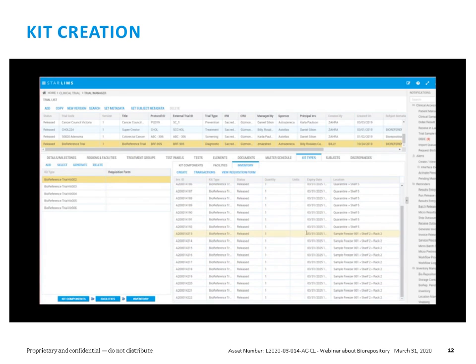The transactions that we have in our system then will be basically all tracked here. You have all your inventory of kits, in this case, are going to be associated to a clinical study, and that inventory will be now available for you to perhaps move them to other storage locations or ship them, which is going to be the typical case that once you create these kits, it's because the next thing you need to do is to ship those to the clinical sites for the sample collection.